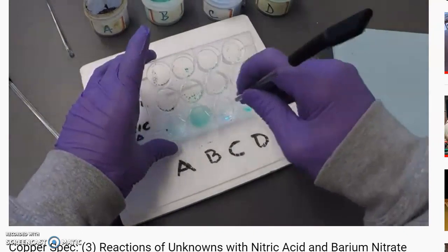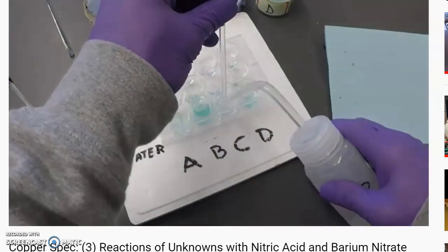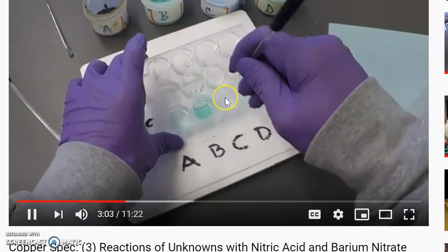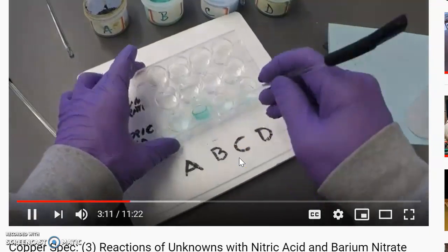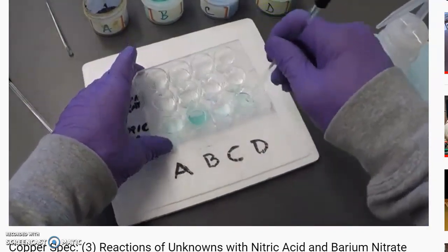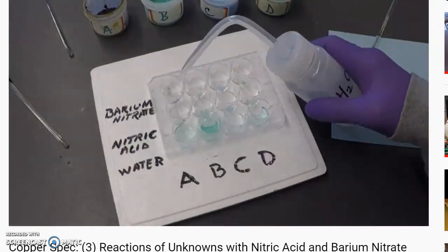So I don't want to necessarily waste all the time that I have left. But you can see A is certainly dissolved. B still looks cloudy to me. That looks cloudy. C looks like it's dissolving up quite nicely. Nice and clear solution, not cloudy at all. We have to change our stir rods in between so we don't contaminate. So 3 have dissolved. B is the only one that didn't dissolve.